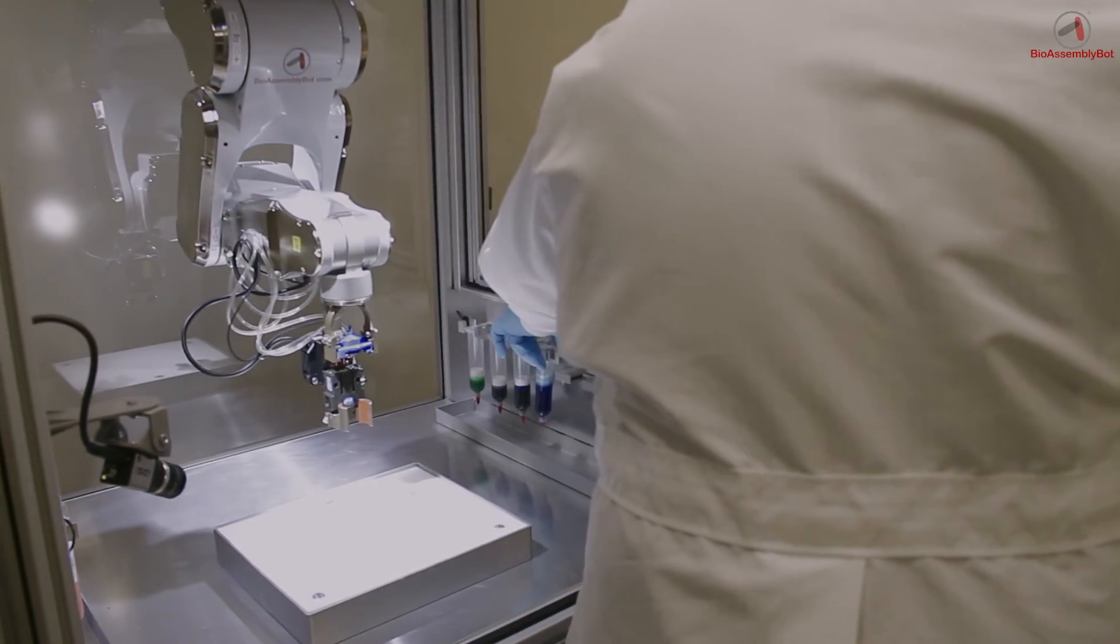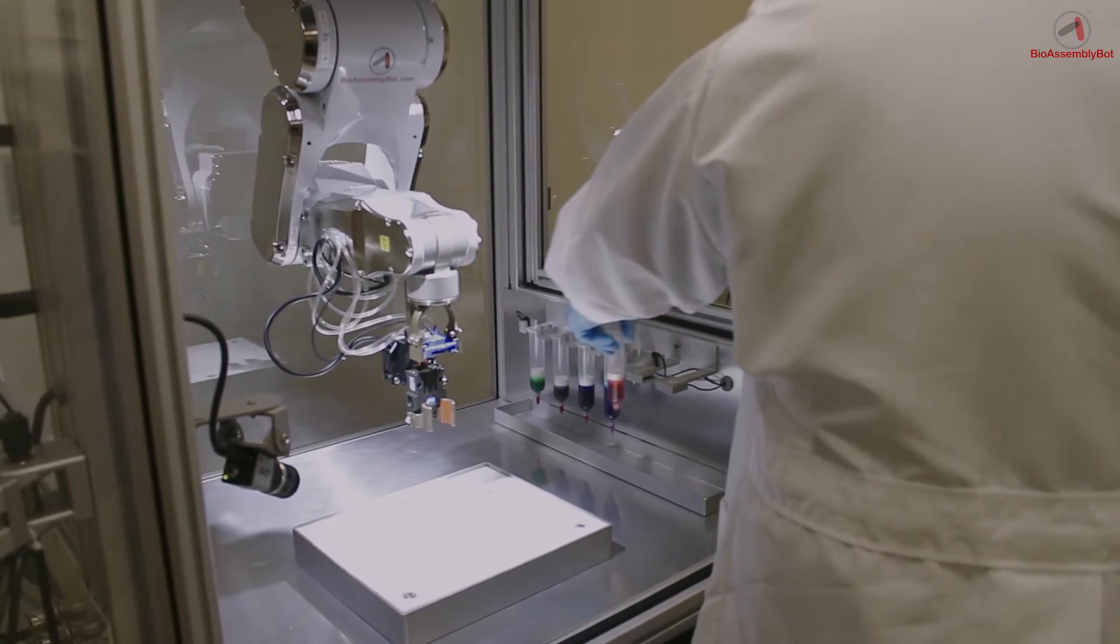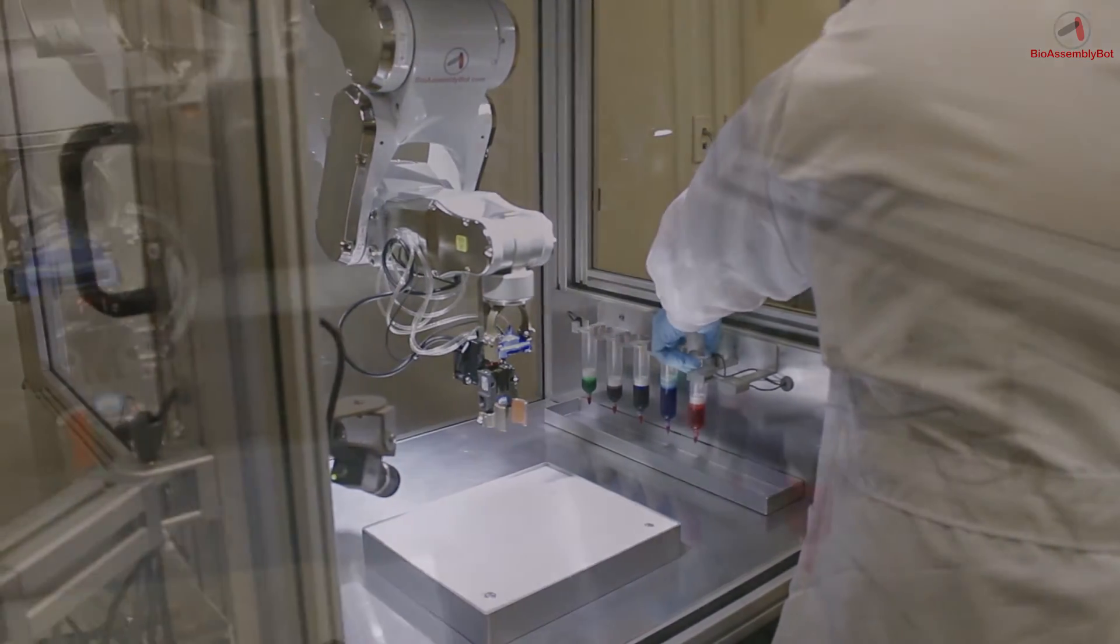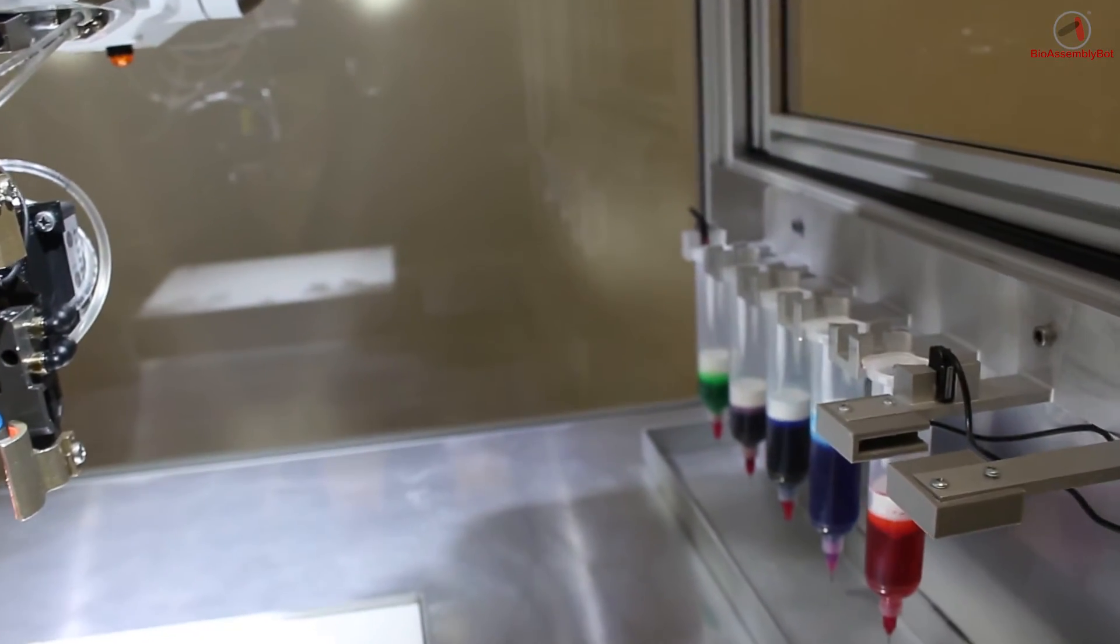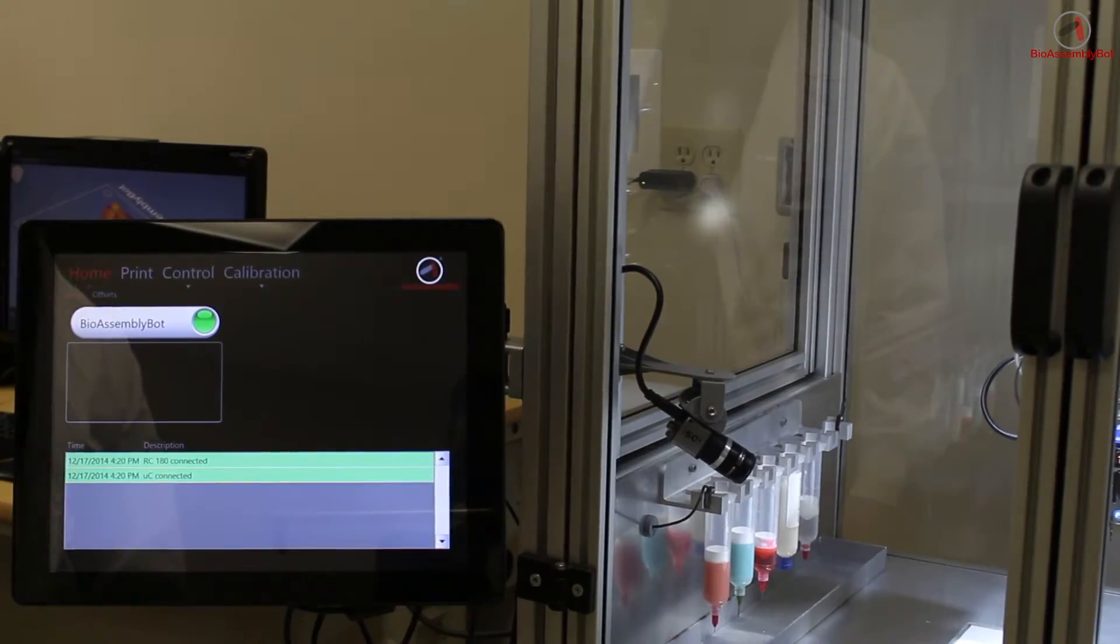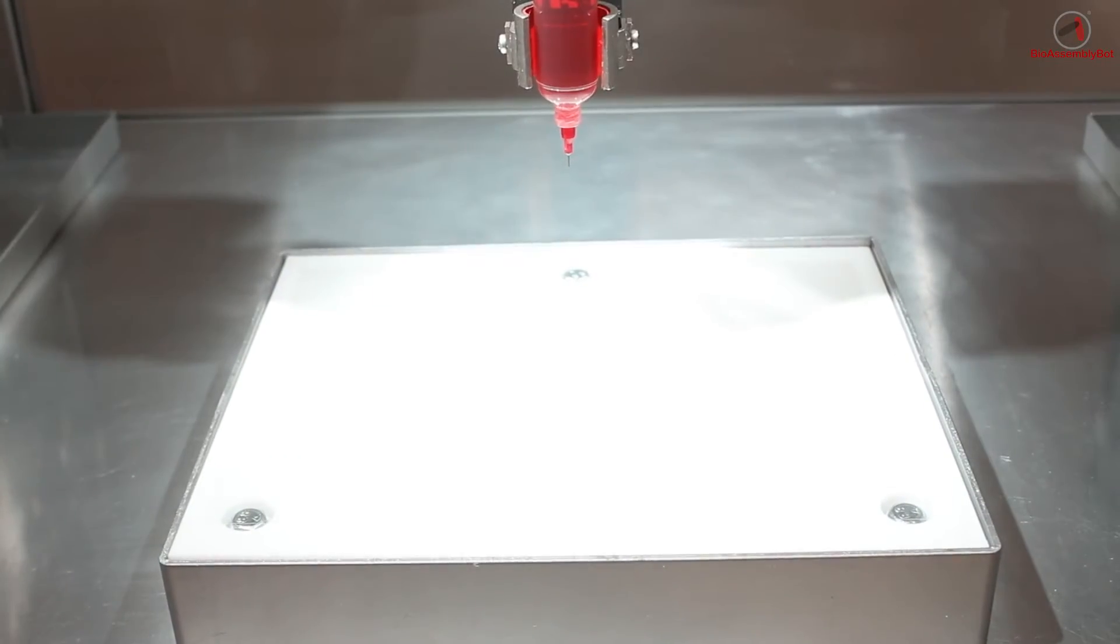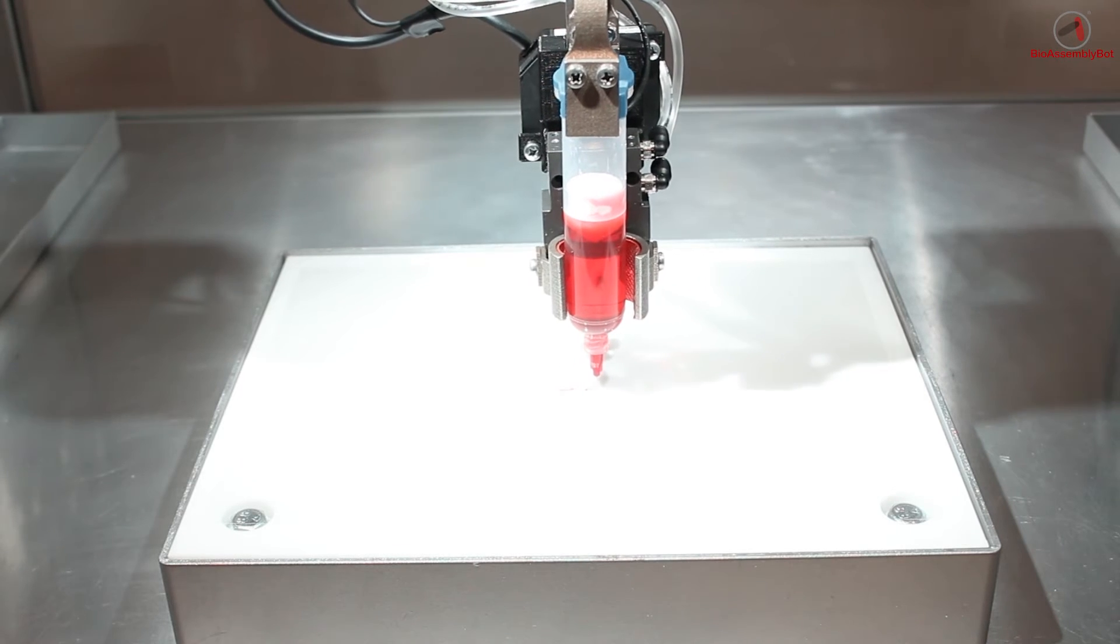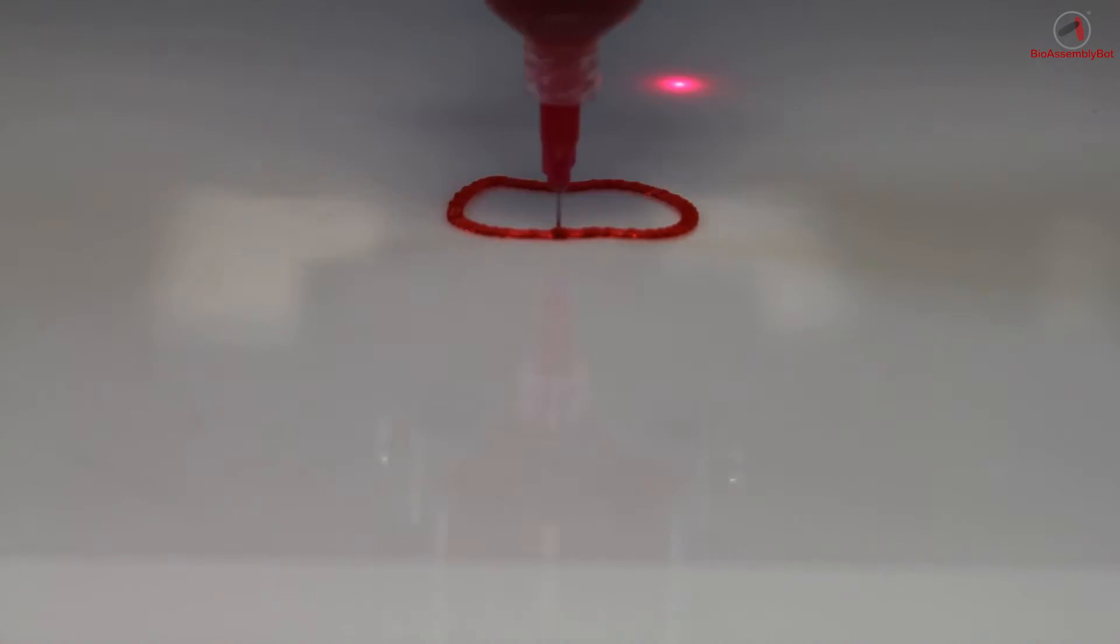Here he's putting in two different hydrogels, one to be the body of the heart and the other to be the vessels. Once he is ready to go, he confirms the print, and the printer automatically starts the print job.